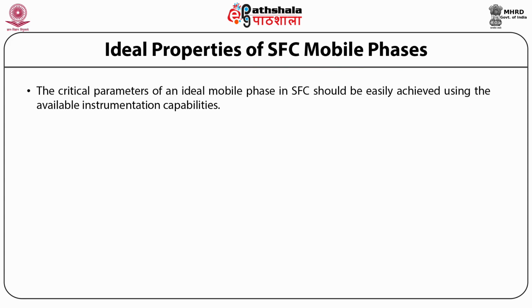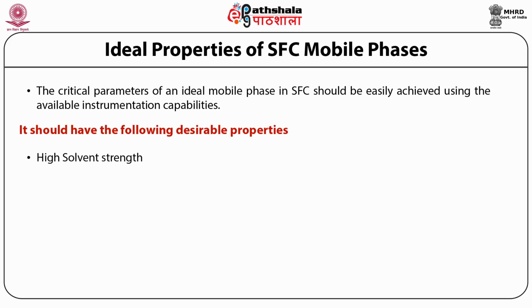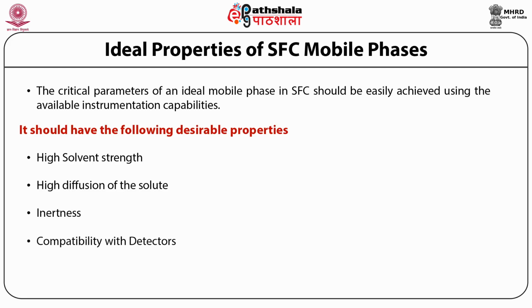The critical parameters of an ideal mobile phase in SFC should be easily achievable using available instrumentation capabilities. It should have the following desirable properties. 1. High solvent strength. 2. High diffusion. 3. Inertness. 4. Compatibility with detectors.